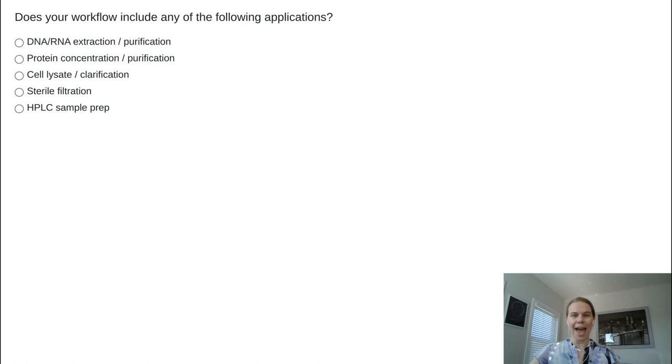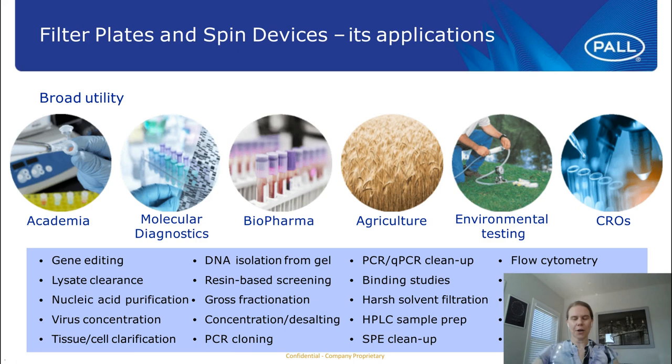Thank you. Okay, so again, in terms of the applications, filter plates as well as centrifugal spin devices can be used in so many different applications. I literally ran out of space just typing those applications in the blue box below. As you can see, there are so many, ranging from nucleic acid extraction, purifications, resin screening.